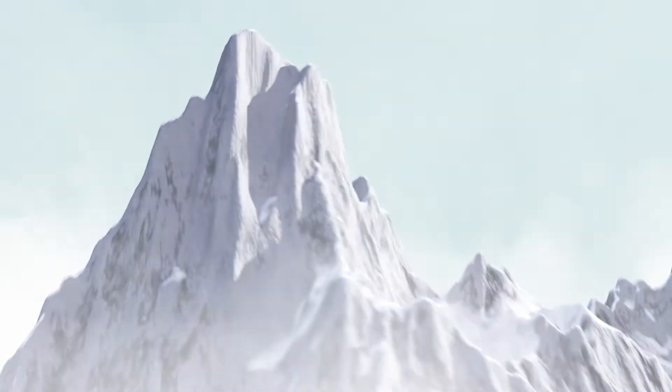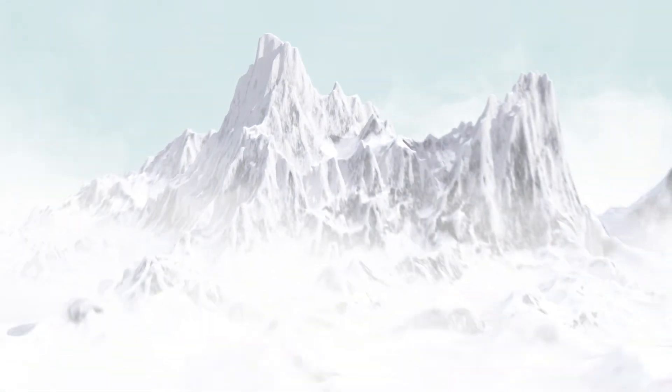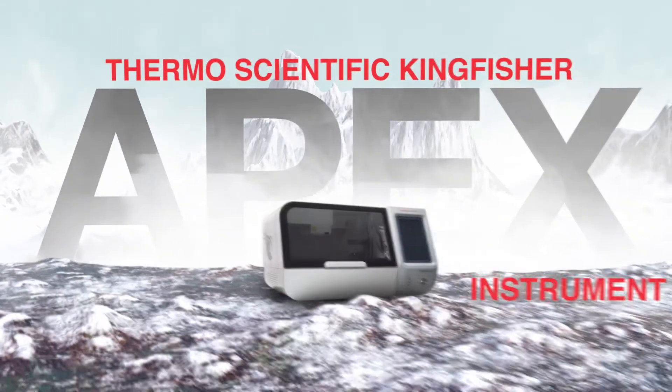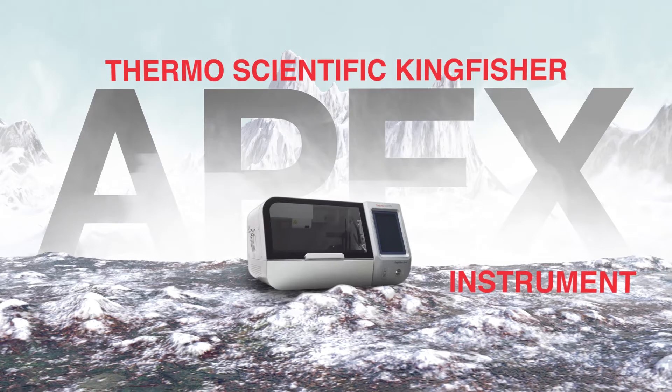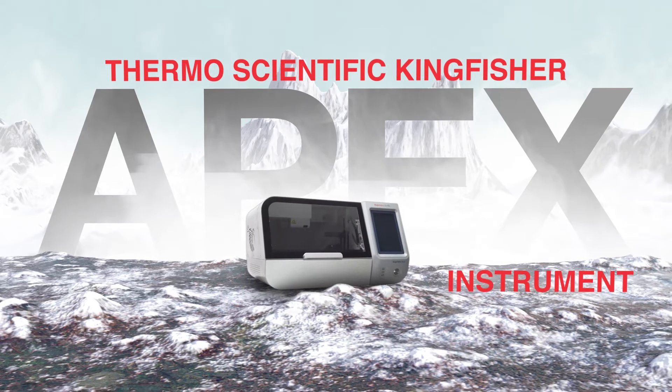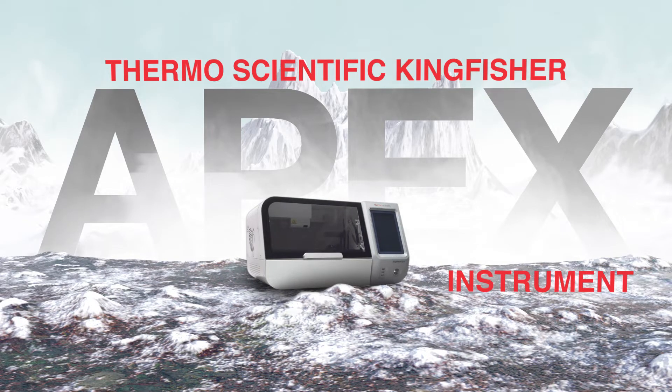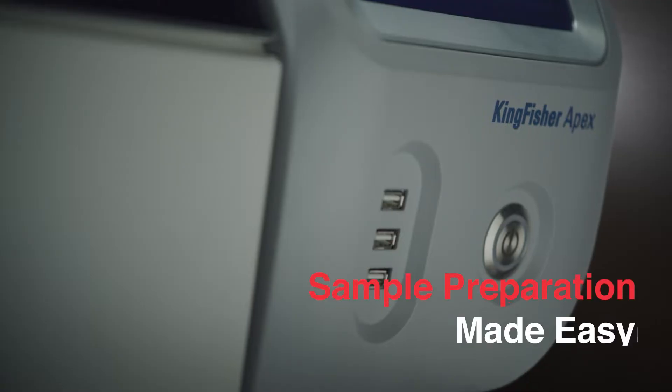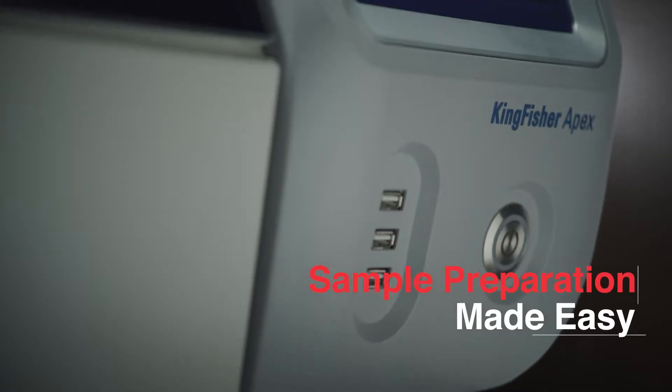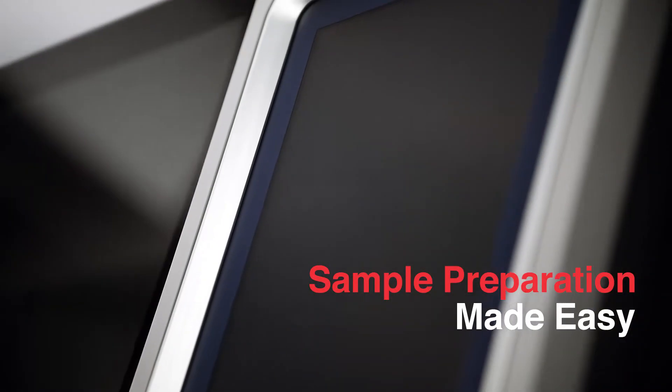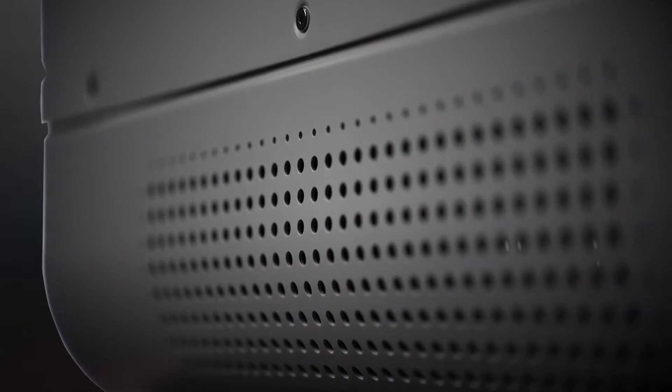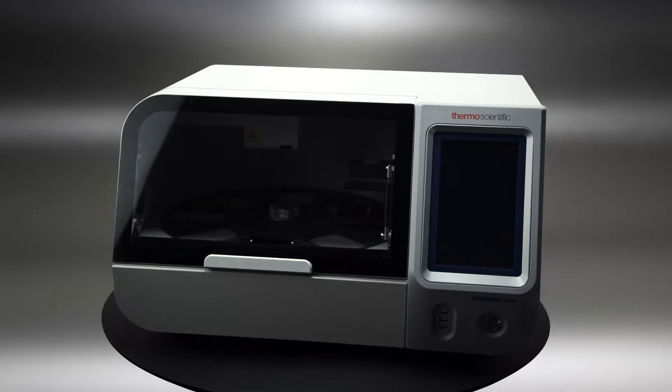Welcome to the pinnacle of automated purification. This is the ThermoScientific Kingfisher APEX instrument. Sample prep should be simple, so we designed an automated system to handle your lab's needs.